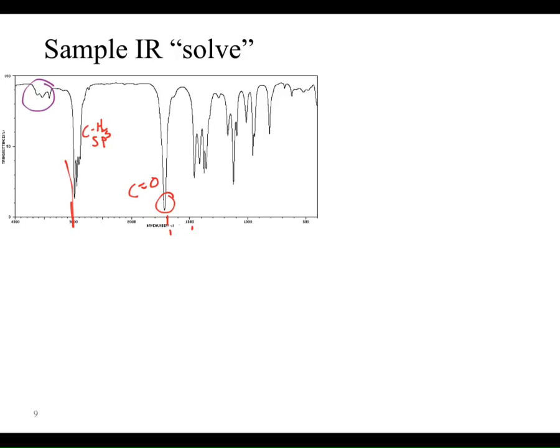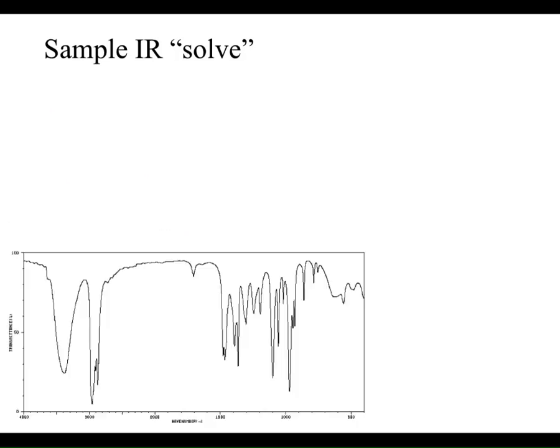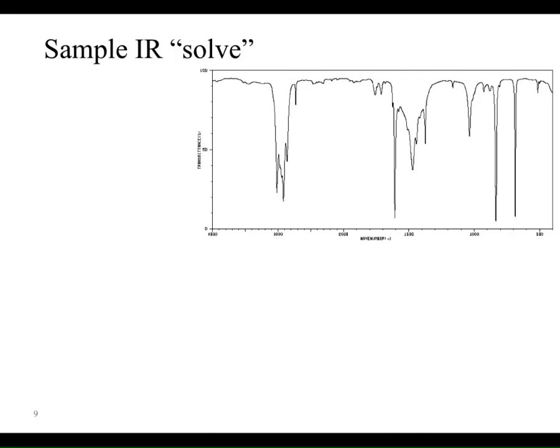Okay? So, spectra 2. Take a second to pause and do the analysis as best you can. And here we go. We have OH. We're at that 3000 line again. CH sp3. And done. Okay? Well within 30 seconds. Problem number 3. Take a minute to pause and do it. Whoops. Now I'll go ahead and show it.